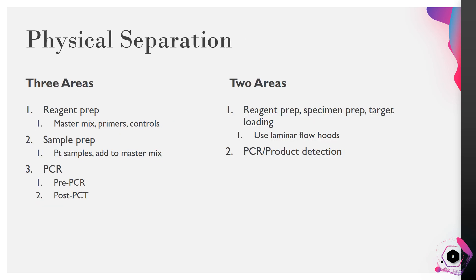If space allows, a molecular lab would ideally have three physically separate spaces: one for reagent preparation, one for sample preparation, and one for PCR and analysis. If space does not allow, two separate areas can work — one for preparing reagents and specimens, and the other for PCR and analysis. In that case, the use of laminar flow hoods can help keep reagent prep and sample prep separated and reduce the probability of contamination.